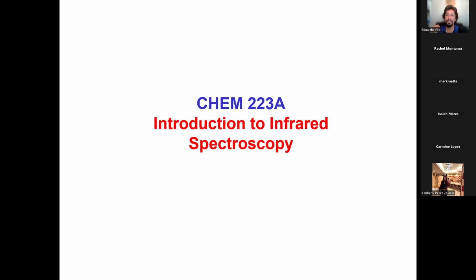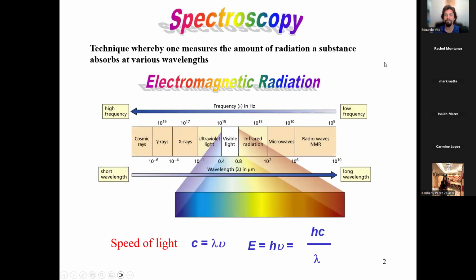And when we're doing organic synthesis, which we do in organic chemistry, you actually create molecules and you need to find out whether you are on the right path or not. We cannot go down to microscopic size and actually see the atoms. We have to measure them in different ways. We can do melting point, we can do TLC, we can do column chromatography, and this is just another thing that we can do as well. Usually we do it pretty often in organic synthesis. It's infrared spectroscopy. So let's talk about spectroscopy first.